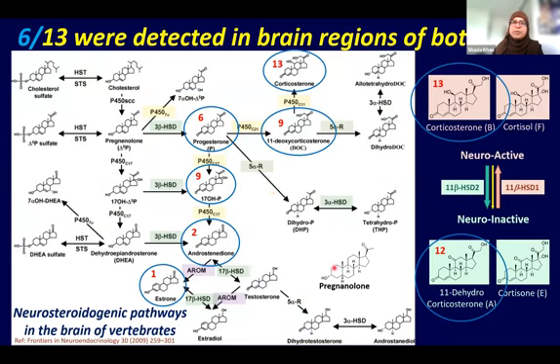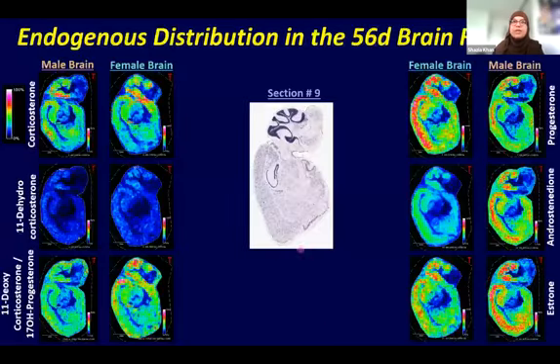It suggests the others may be below the limit of detection, which may require technology advances and/or alternative sensitive analytical approaches. This highlights another challenge associated with neurosteroid imaging and the importance of technology advancement and a sensitive workflow.